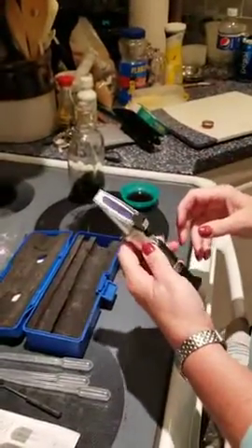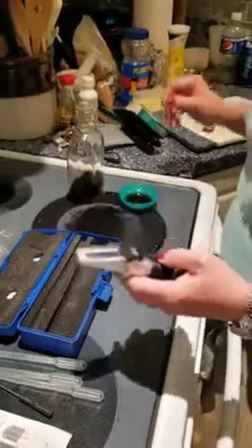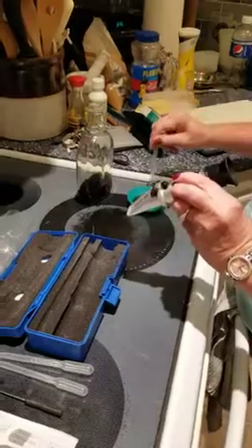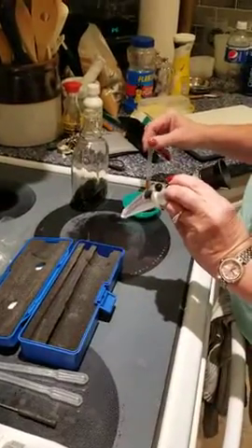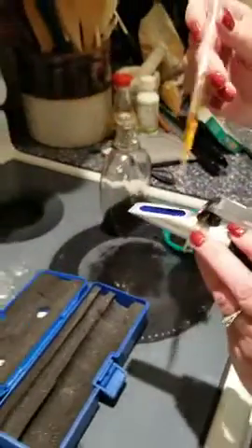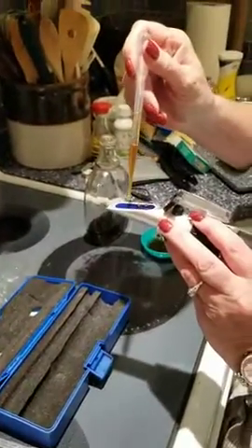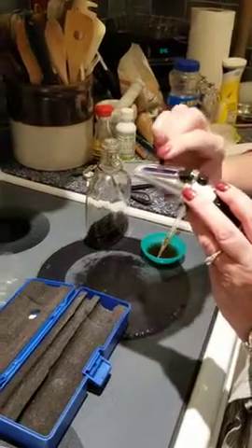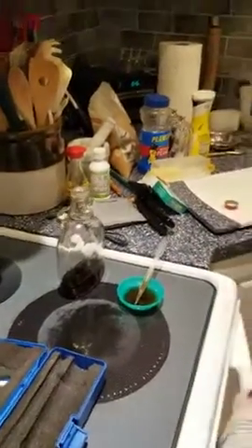I have maple syrup that I made in the spring and we're gonna test it out. It should come up to 66 brix. So all you need to do is open that, put a couple drops of syrup on the plate, close it up, and take a look inside.